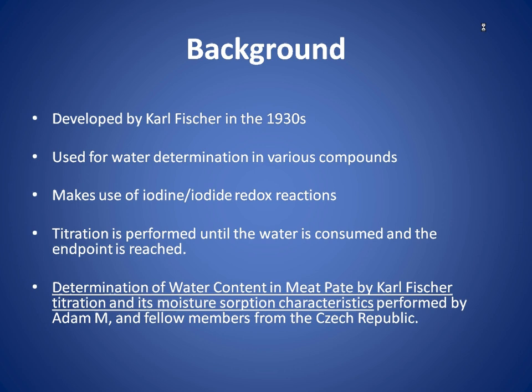Karl Fischer titration method is used for water determination in various compounds. Water can directly or indirectly enter food or drugs, and a known water concentration is needed to correctly establish the lifetime and stableness, as well as important in every step of the way from initial product till the finished product.